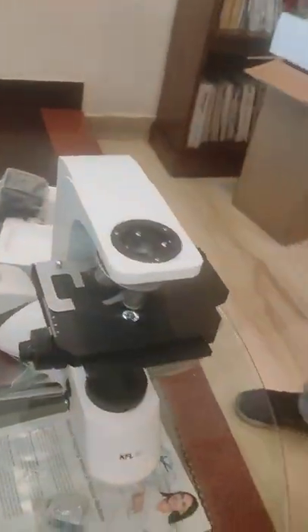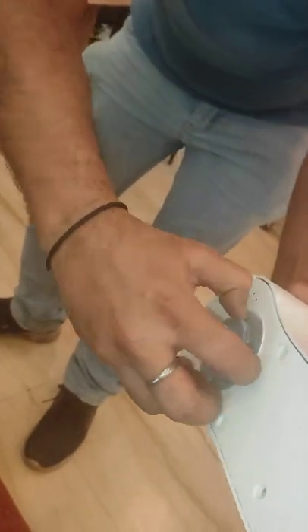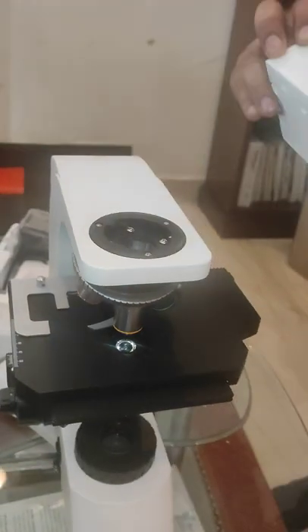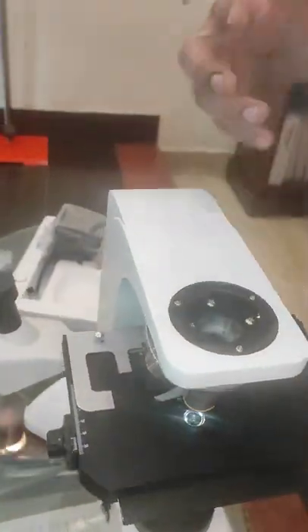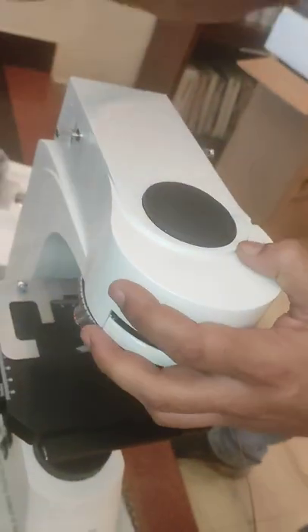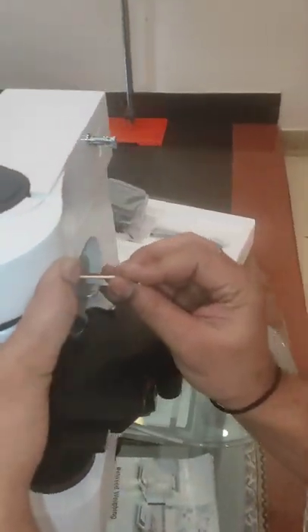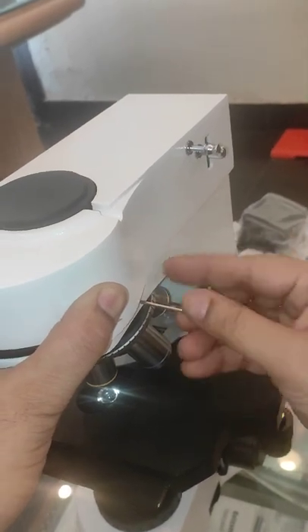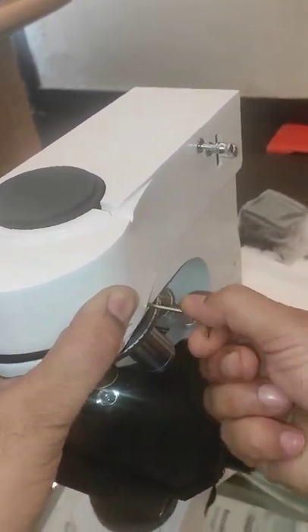We take out the cover. These are the slots — it has to be nicely put in the grip. There is a little tweak sound and we will screw it. Then remove that cover.